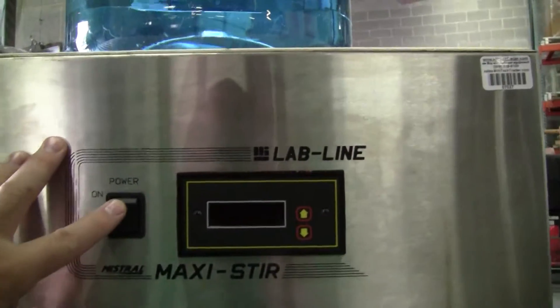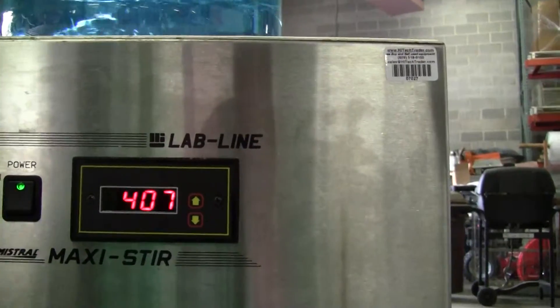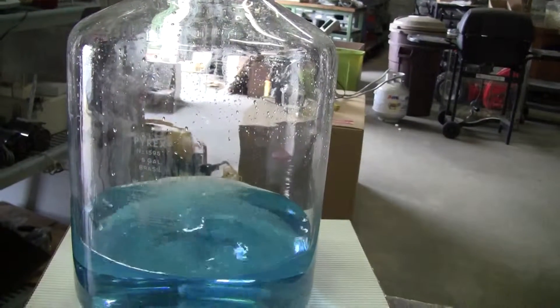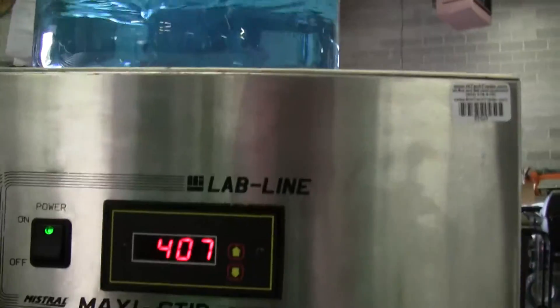Let's turn it on, take a look. It's got 2300 max rpms. We're at 407 right here. Watch it spin. See it's working nicely. Let's go a little higher on the rpms.